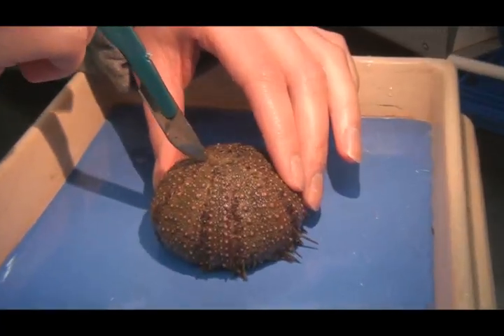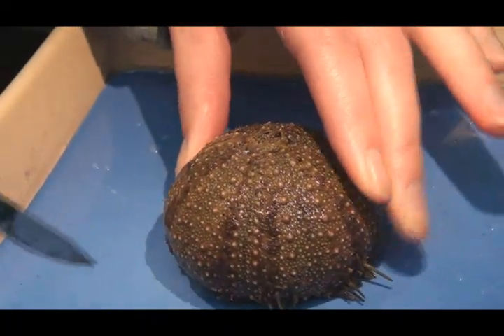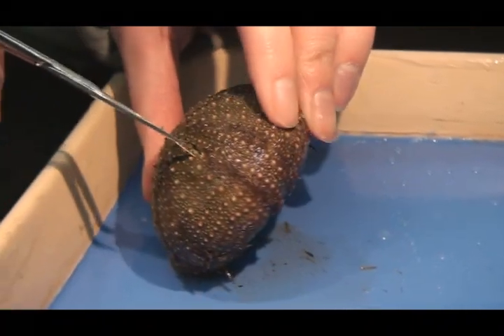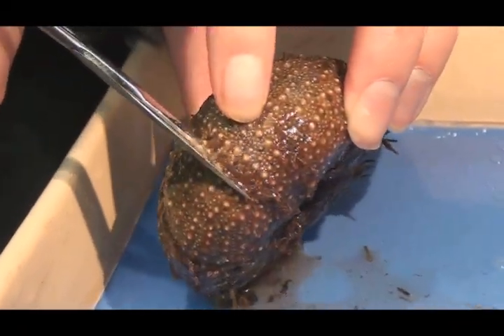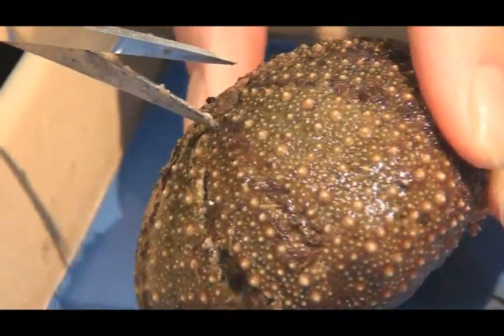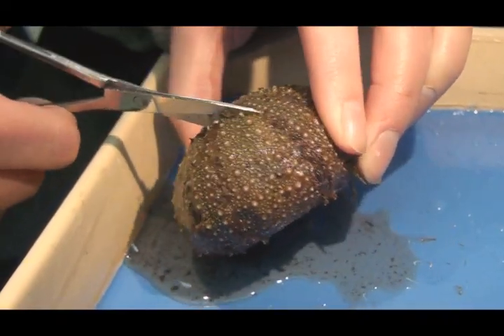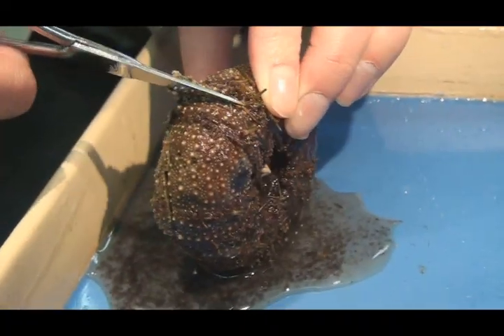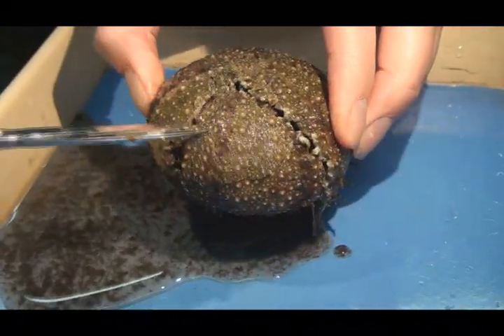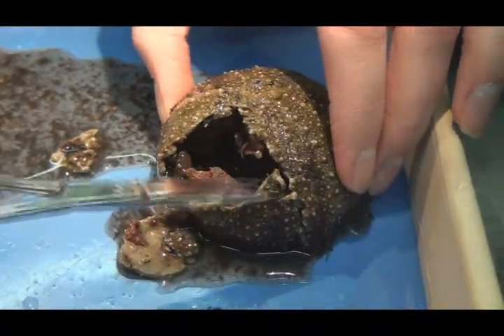Now it's time for the fun part. Grab your scalpel and give it a nice stab towards the top. After you have a nice little slit cut in the top, grab your scissors and cut out a nice big chunk. Some juice is expected — this one happens to be extra juicy. That is a lot of juice. Keep on cutting. There we go, now it's opened up. Now we can look at the insides.